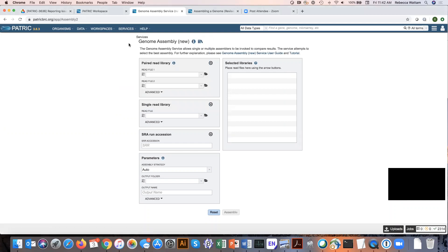Patrick accepts three types of files: paired reads, single reads, and accession numbers from the Sequence Read Archive.